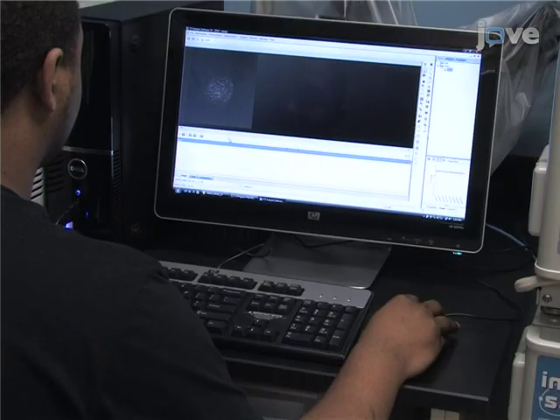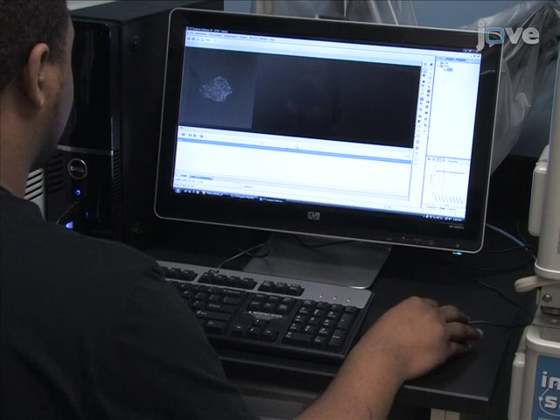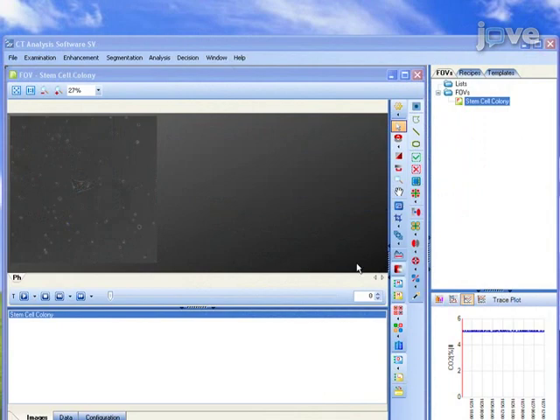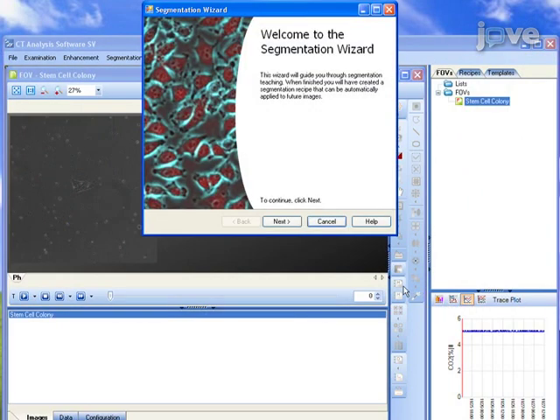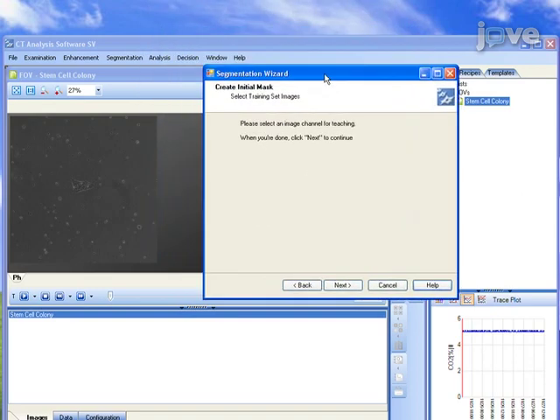To create the segmentation recipe, first manually scan the entire video to verify that it contains a single colony that remains focused throughout the recording period. After this, open the segmentation wizard in the CL Quant software and click the Next button. Select the correct image channel and click the Next button. Pick Soft Matching and click Next.